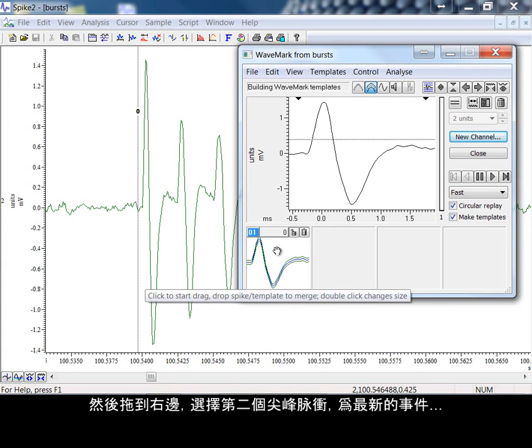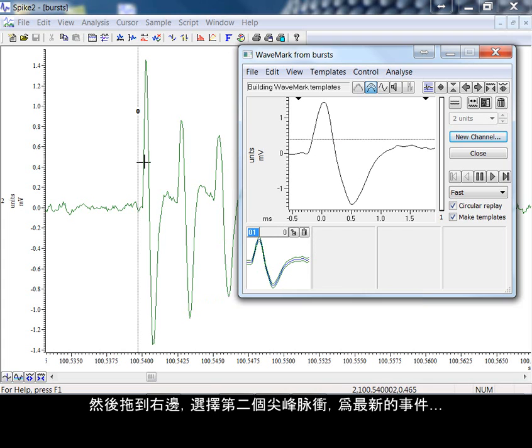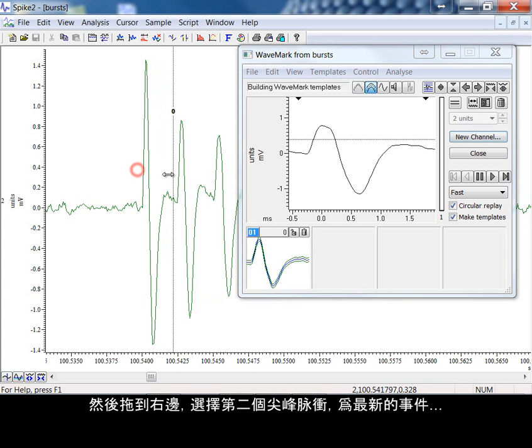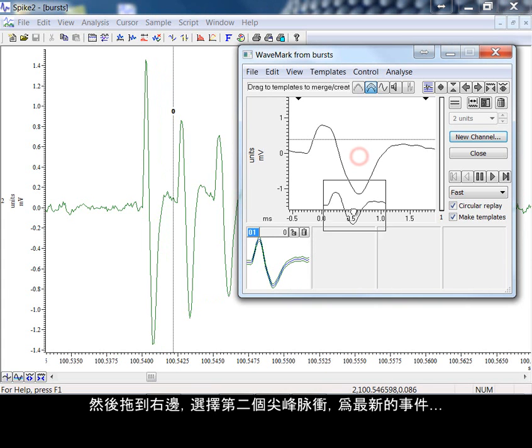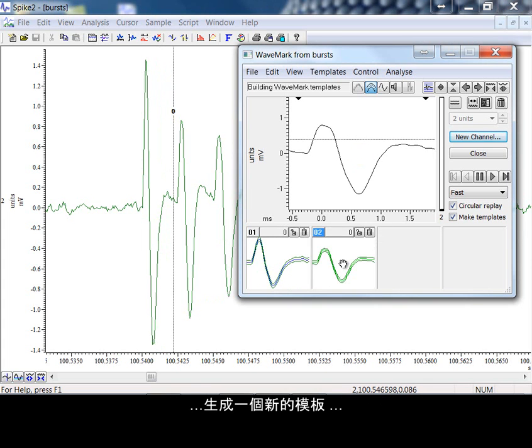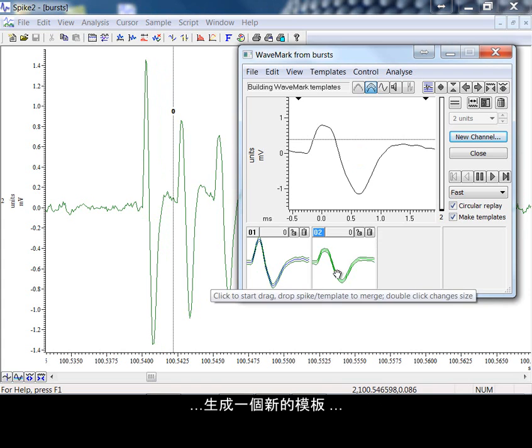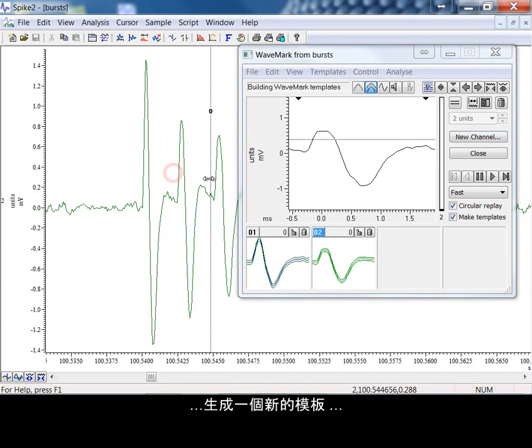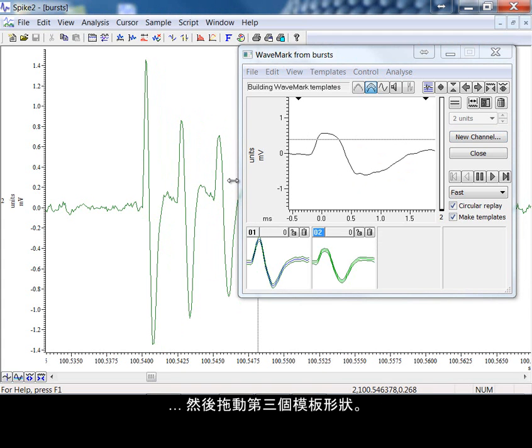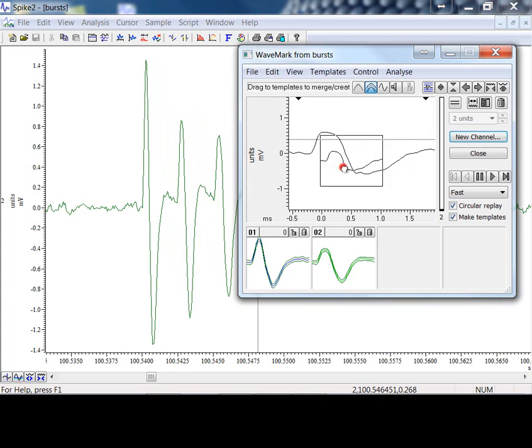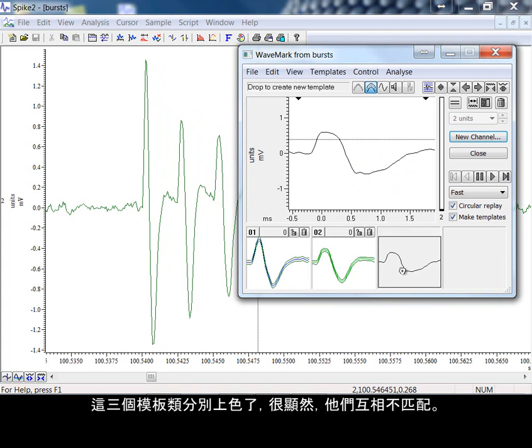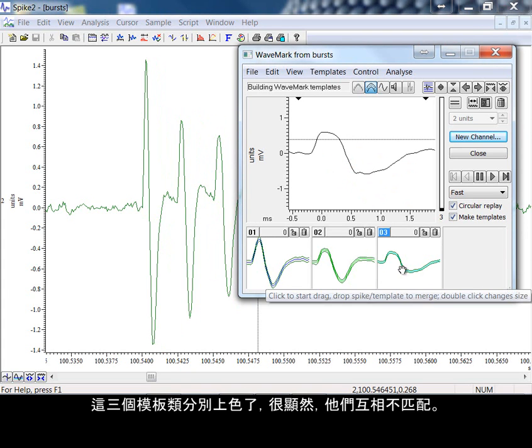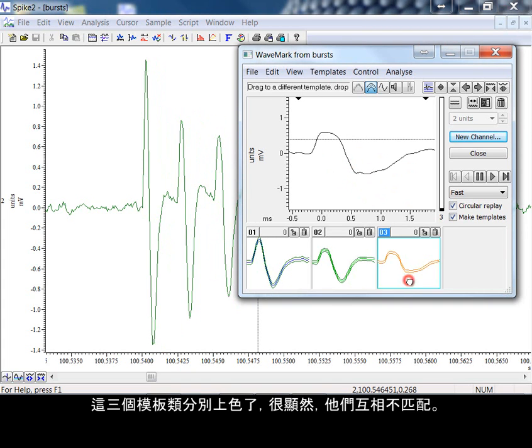Moving to the right and selecting the second spike, forming another template. To the last event and I drag another template shape. The three template classes are colored and it is obvious that they do not match each other.